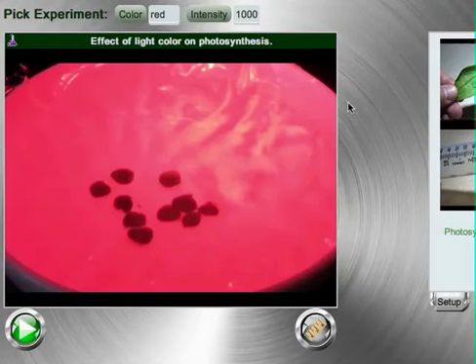Welcome to the Smart Science Lab about photosynthesis and light. In this lab you are trying to discover what color of light is most effective in photosynthesis in green plants.